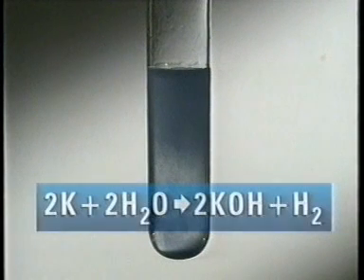Universal indicator goes blue. Potassium reacts with water to form potassium hydroxide and hydrogen.